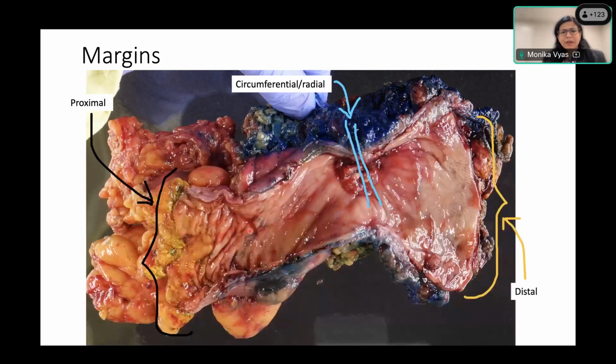So here are some examples. So this is a rectal cancer specimen. So we have a proximal margin and a distal mucosal margin here that I've labeled. And then we have this portion which is inked with blue ink here. And that is the part where there is no serosa. So it's the soft tissue which has been dissected along the visceral plane, and relationship of the tumor to this soft tissue edge would be a circumferential or radial resection margin.